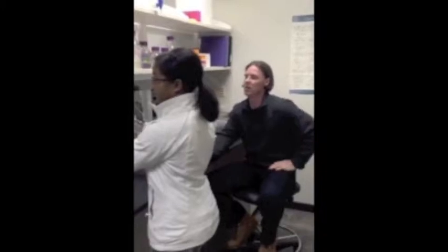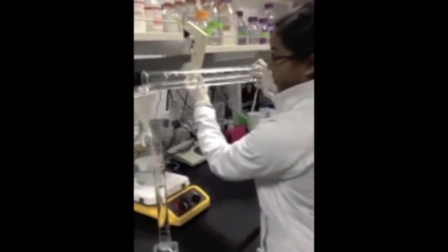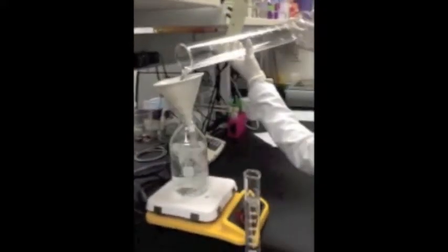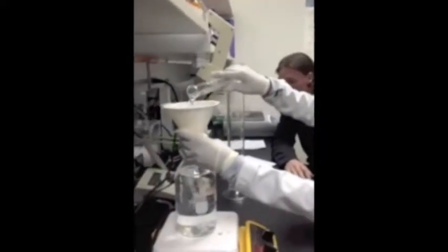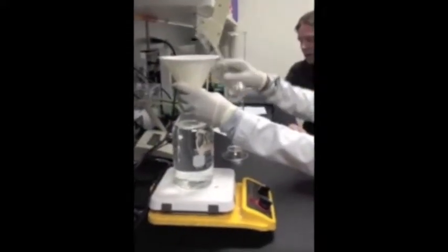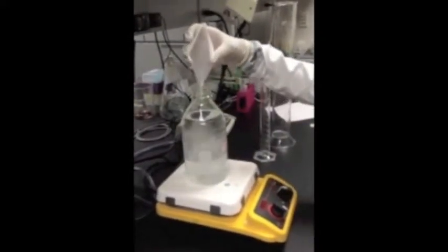So Jesse's going to be using a PBS solution, phosphate buffer saline solution. We use this a lot for washing the different tissues in order to do IHC and other methods. She's combining 100 milliliters of PB, the phosphate buffer, 900 milliliters of double distilled H2O, and 9 grams of sodium chloride. And then we leave it on the mixer with the magnet at the bottom mixing everything up. And this gets stored in the fridge for when we need it.